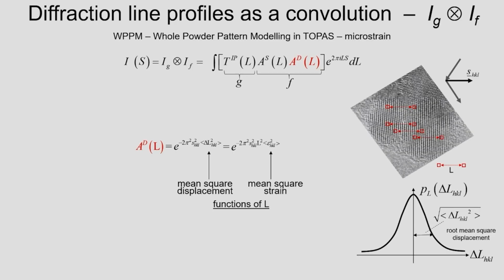This is a crystal with a dislocation. I hope you can see it. It is sitting right here. This is the effect of the coalescence of 2 ceramic nanocrystals which trapped the dislocation in between. Now, if you measure the distance between any 2 points, a distance L, in different parts of the crystal, of course, that distance will be different, not a constant. So the displacement will be different and dependent on the distance, and also dependent on the direction.